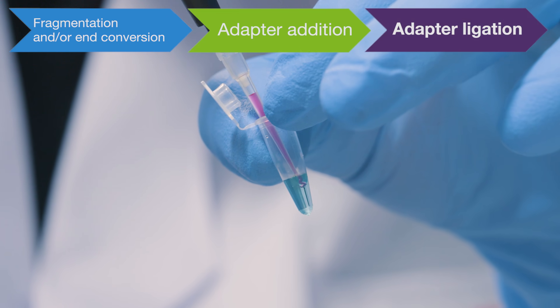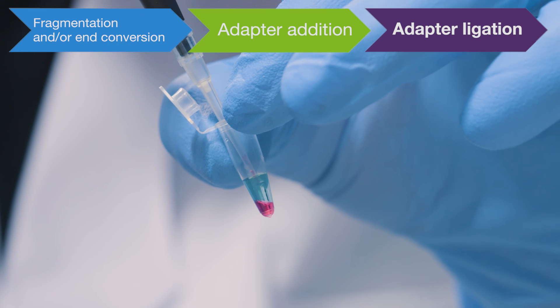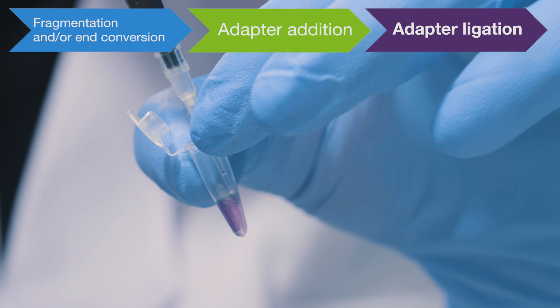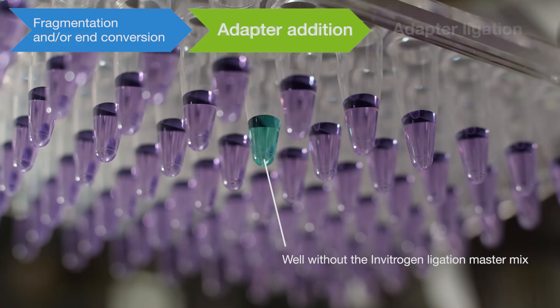When reagents are added in sequence, colors are distinct because of the differences in viscosity. Thorough mixing of the reagents yields a homogeneous color, providing an in-process visual cue to improve workflow success. Colored dyes also provide a visual indication if mistakes occur in the reaction setup.